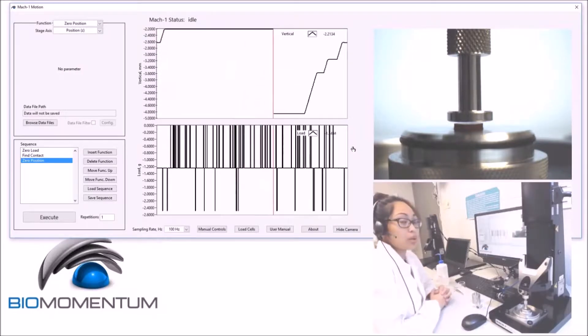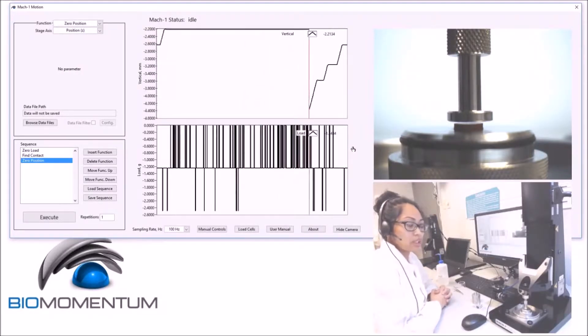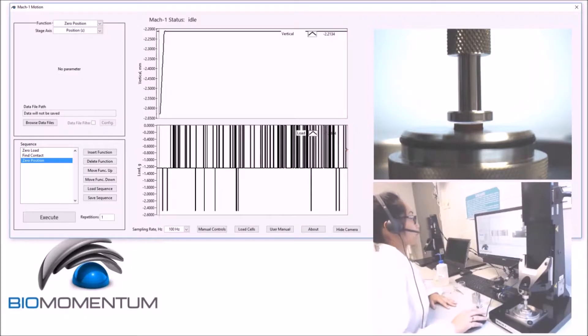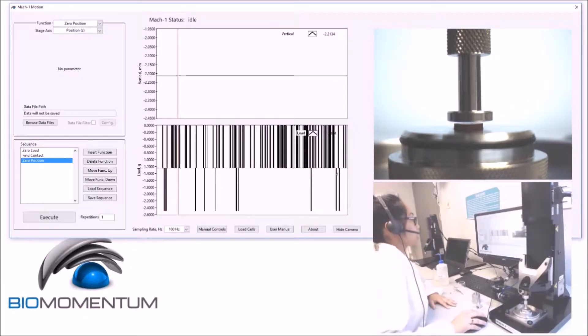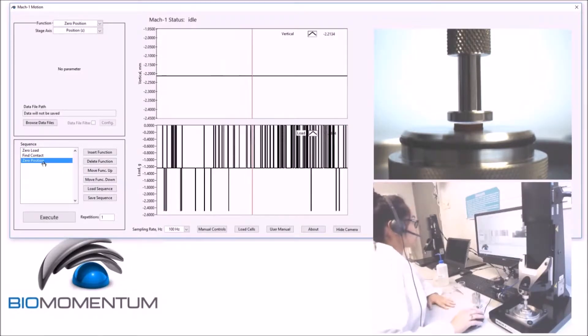Now we will measure the rubber disc thickness. We will build the following sequence.